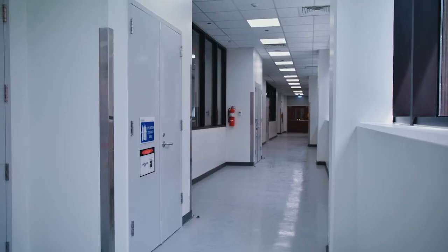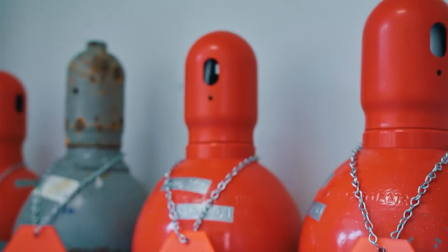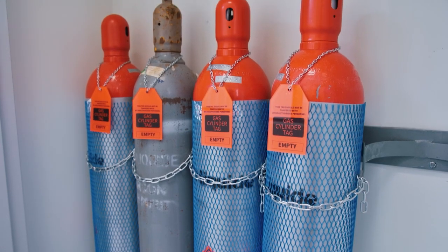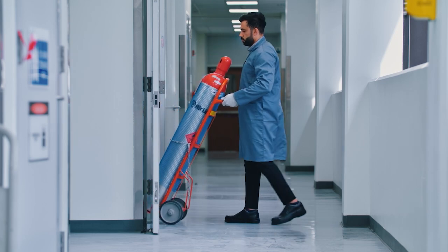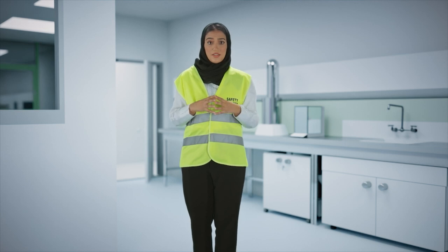Empty cylinders should be clearly marked and stored separately. Always screw a cap on top of the cylinder to protect the main valve while transporting. Gas cylinders may only be transported on a gas cylinder trolley. You can only keep the number of cylinders you're going to use. Never use a laboratory as a storage area for cylinders.